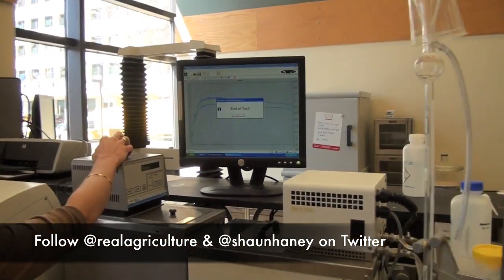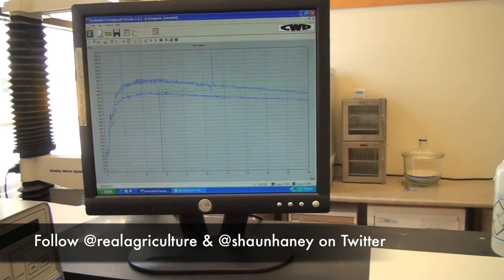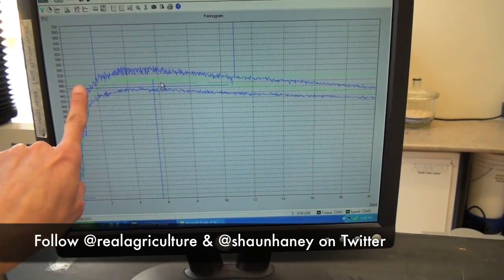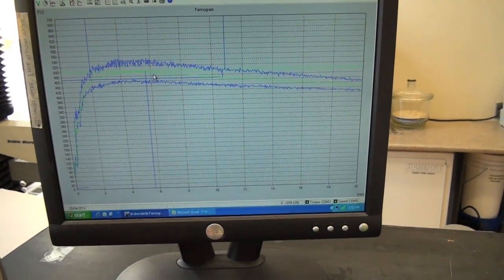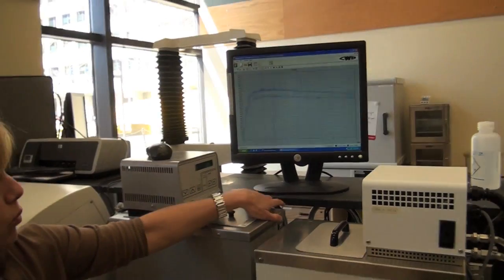The test just ended and right now you'll see all the parameters that come measured. Here was our development time and our stability points right there. We would use this along with the other measurements taken on the flour — which would be the protein, the gluten content, and starch damage levels — to see if they all interrelate as expected and to help fully characterize the flour that we're looking at.